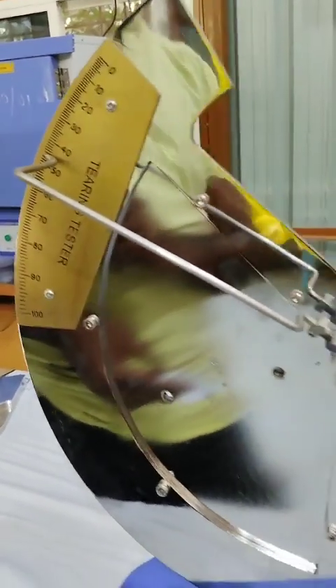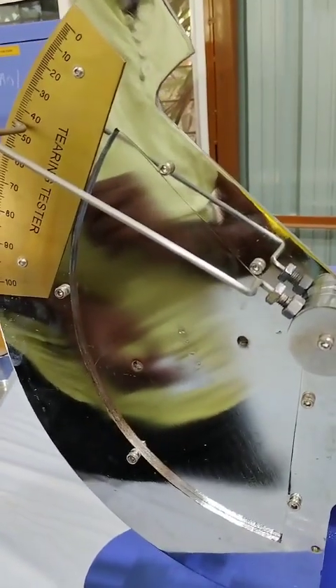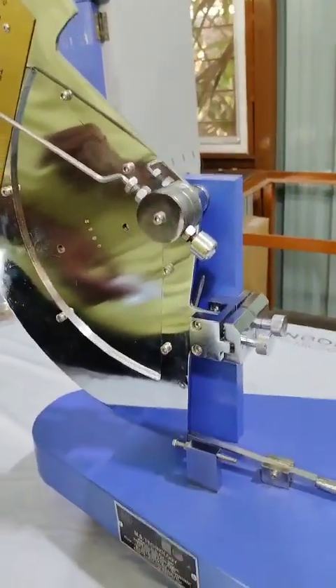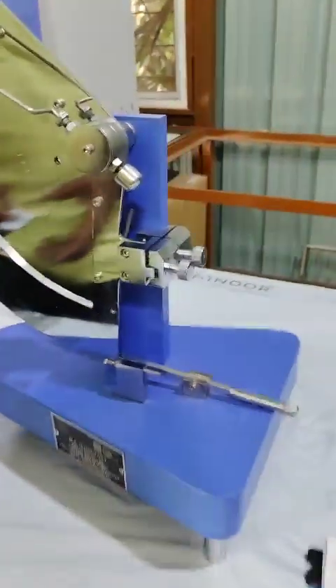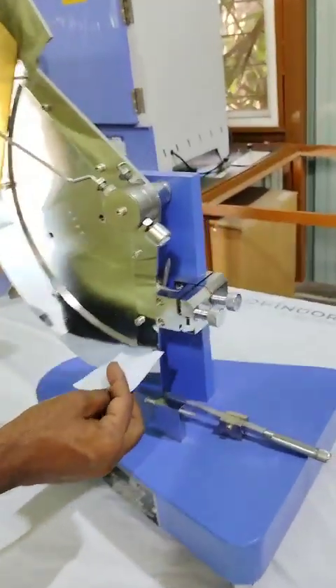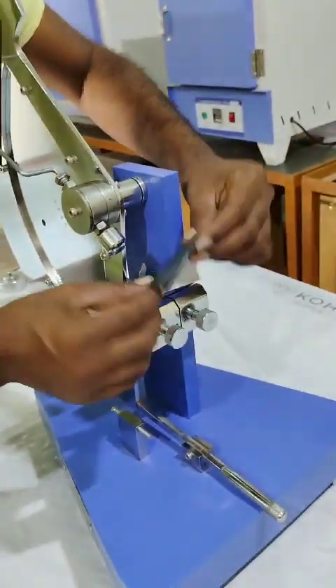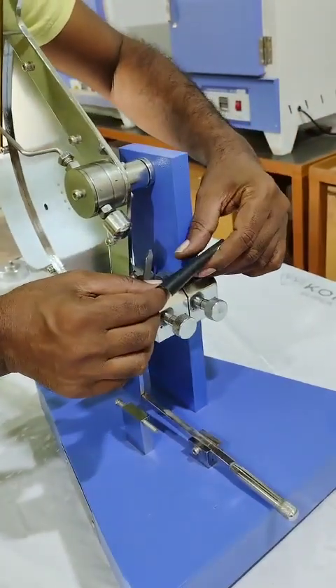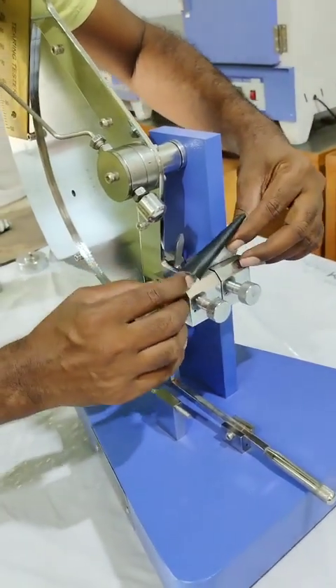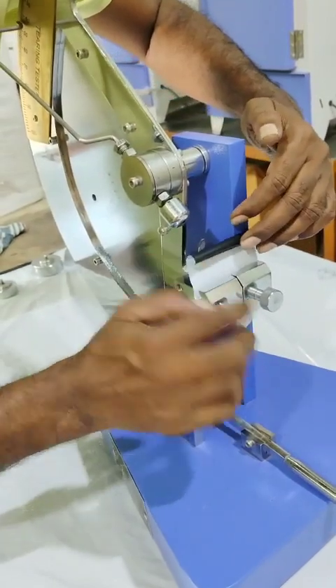As we can see, we have added 520 gram weight, and for the 520 gram weight the lever is at 45. Note it down. Now take a sample in the machine direction. The sample size is 63 mm by 75 mm.